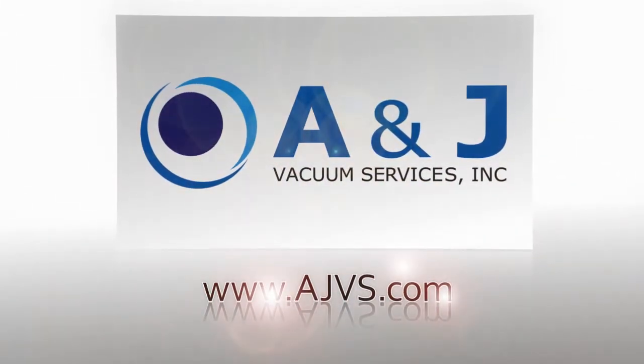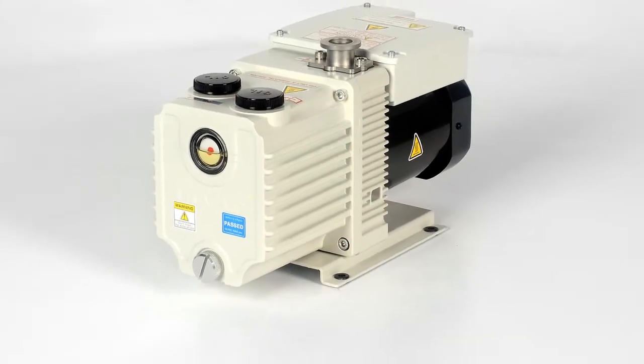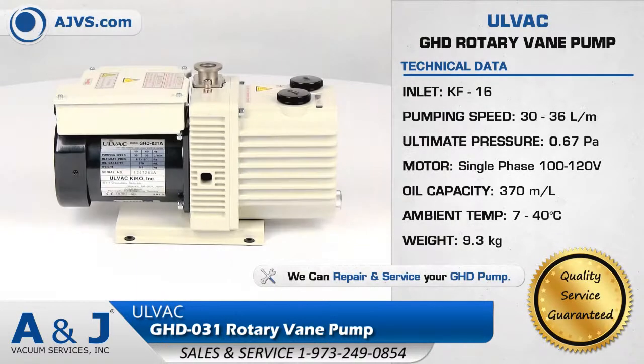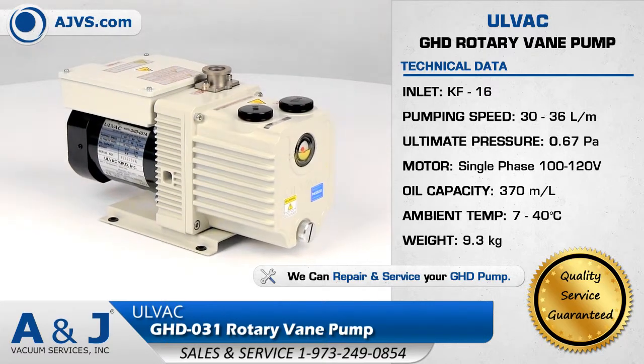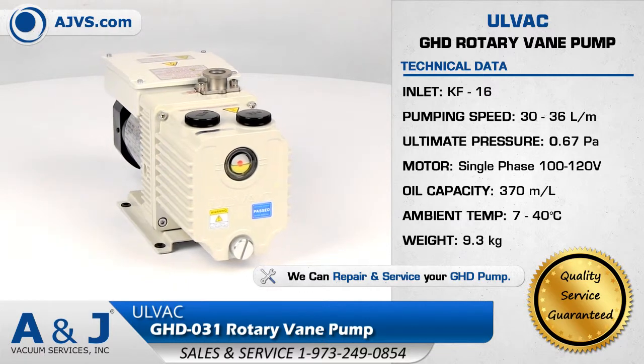AJVS.com, your worldwide leader of high vacuum equipment. The ULVAC GHD Rotary Vane Pump Series features exceptional pumping capability, superior vacuum performance, and state-of-the-art design features.